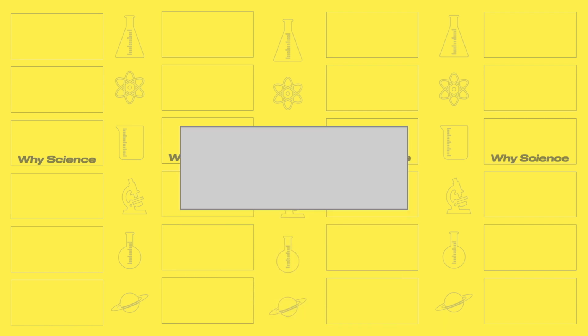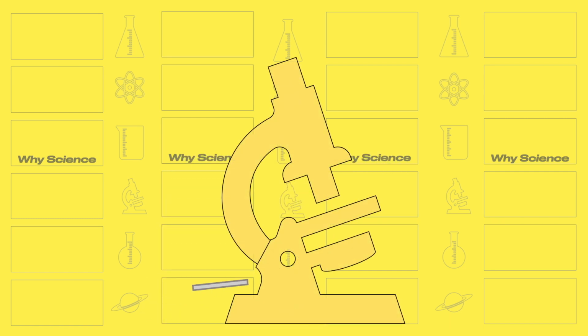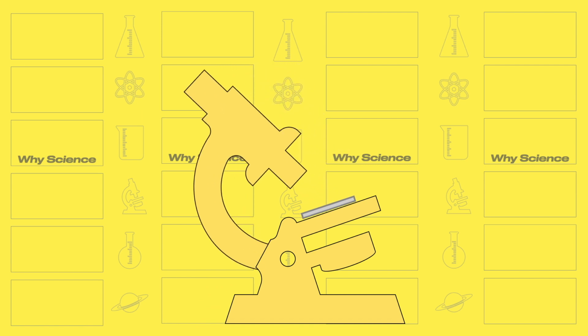To make things simple, get your slide, put your specimen in it, and then cover it with your cover slip. After that, prepare your microscope, fix your slide with your specimen in your microscope, and then you are ready for viewing.